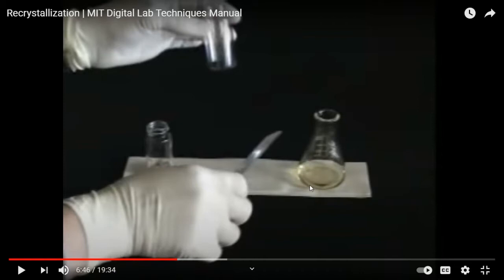But because the temperature is still high, the evaporation of the liquid is taking place vigorously. So these little vapors are rising and escaping. So there is a wind blowing from the bottom, out of the openings. And these charcoals are lighter than cooking powder, flour, okay? It flies so easily, even with vigorous breathing, these things can fly. And that thing is toxic in a sense.